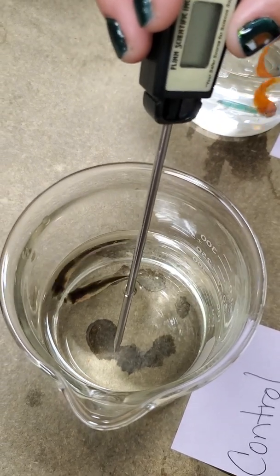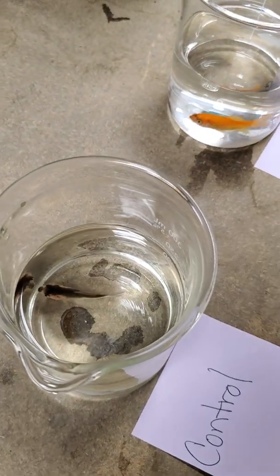Okay, so we are 18 degrees for our control. I'm going to have you count the respiration of this fish again for 30 seconds.